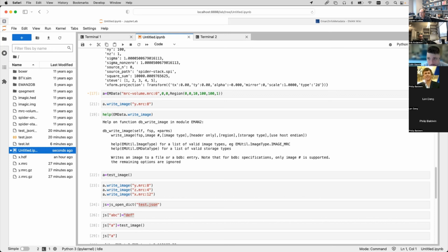Okay. If there are no other questions, I think we'll just stop for the day. And then next week, we'll go a little deeper into some things you can do with EMData objects and how to manipulate them.